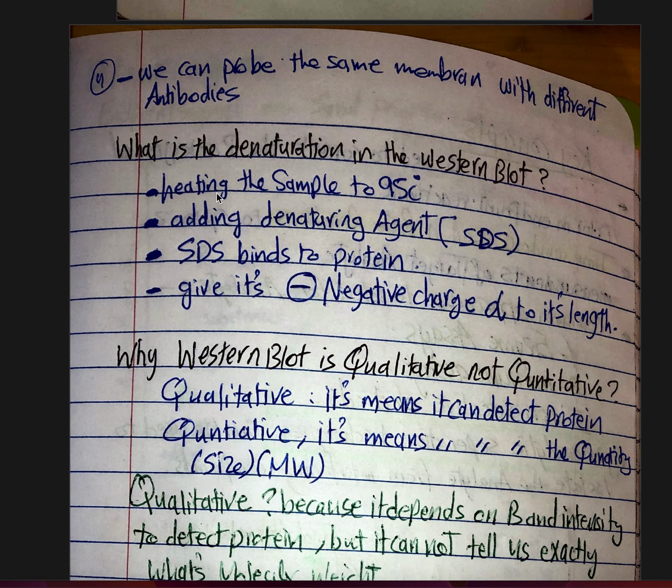So the first thing is that we heat the sample to 95 Celsius. We make it like boiling, I can say, and then we add the denaturing agent, an anionic agent known as sodium dodecyl sulfate, which binds to the protein and gives it a negative charge proportional to its length.